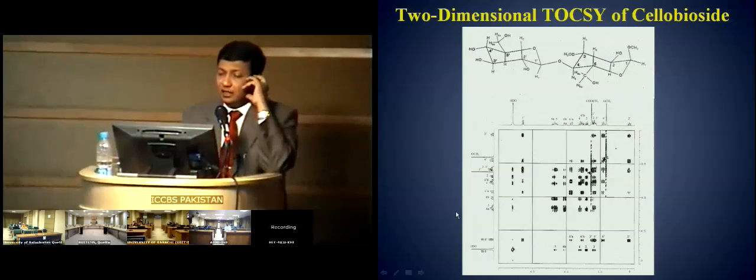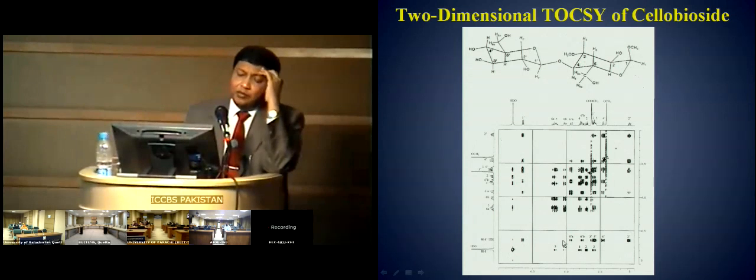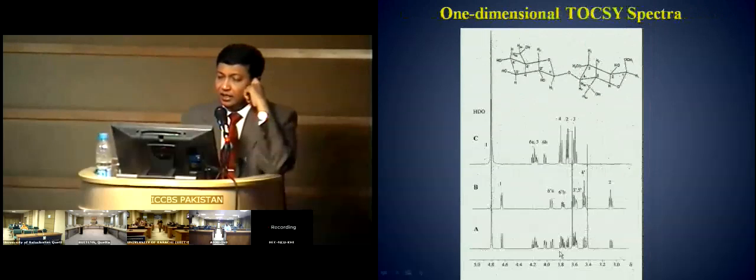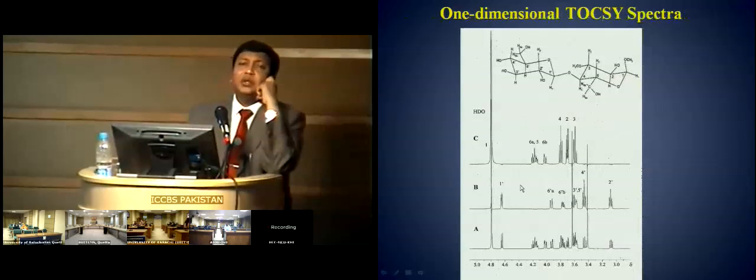And you see that you have a separate spectrum of the entire spin system of this, and you have a separate spectrum of the entire spin system of this one. And if you ask them to give you the slices of the 2D NMR spectrum, you would be amazed that you would get a beautifully nice separate NMR spectrum of each one of them.